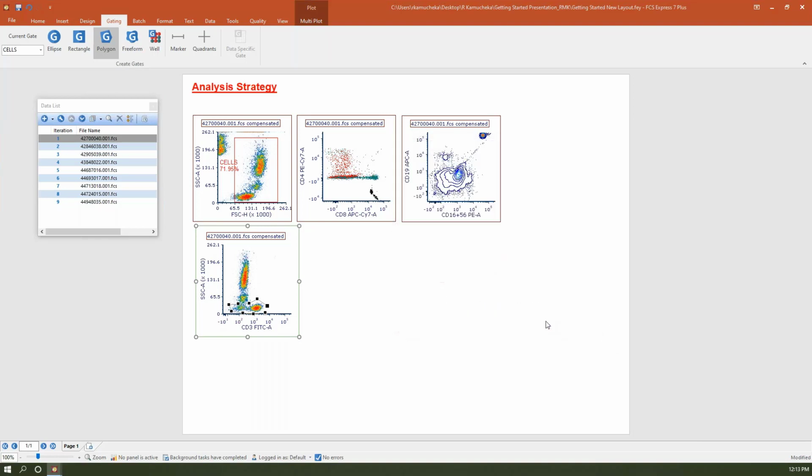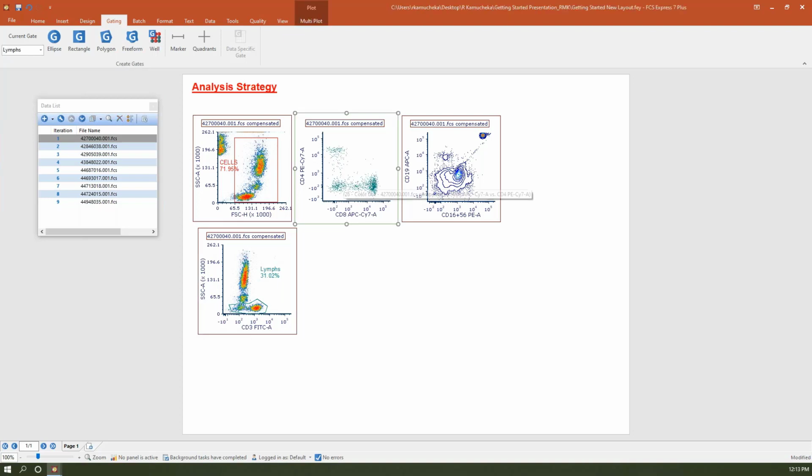and click OK. Now, a really great feature also, love our drag and drop in FCS Express, is that we can drag and drop these gates onto existing plots. As you can see, this plot in the middle here has already started updating with some of these gates that I'm creating. I've got this back gating already built in. So on my color dot plots, when I add gates, it will reflect those gates. So I'm just going to drag my lymphs gate here.